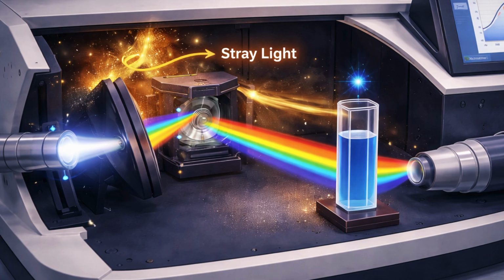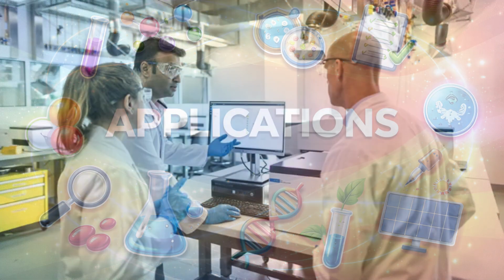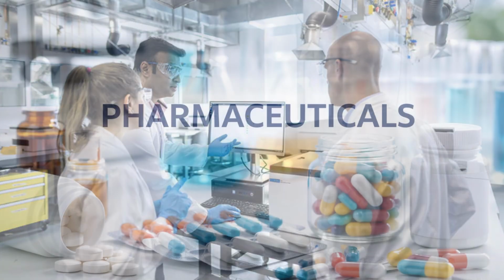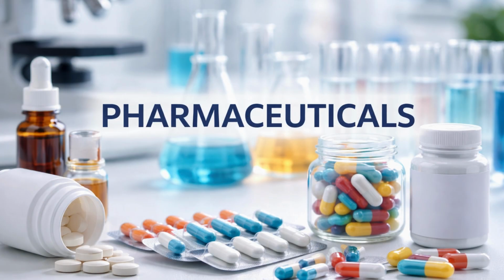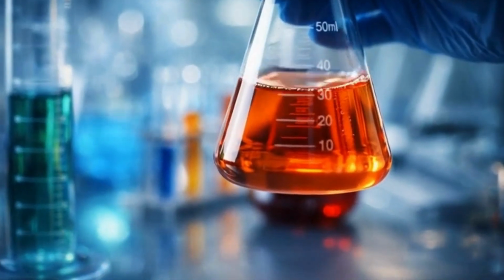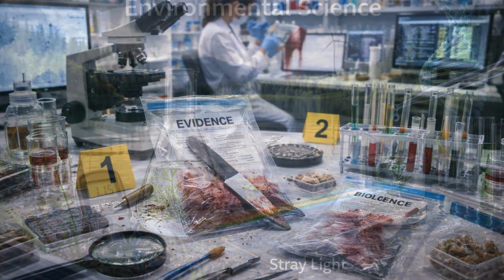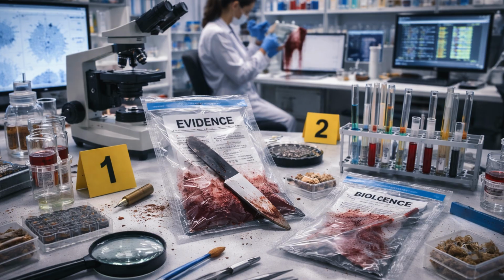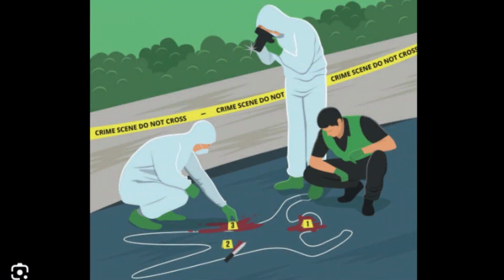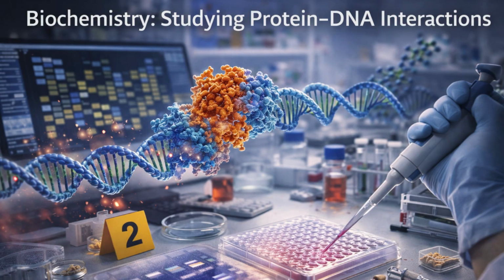And applications: UV visible spectroscopy is used in many areas like the pharmaceutical industry, checking drug purity and concentration. In environmental science, measuring pollutants in water. In forensics, identifying unknown substances at crime scenes. In biochemistry, studying protein and DNA interactions.